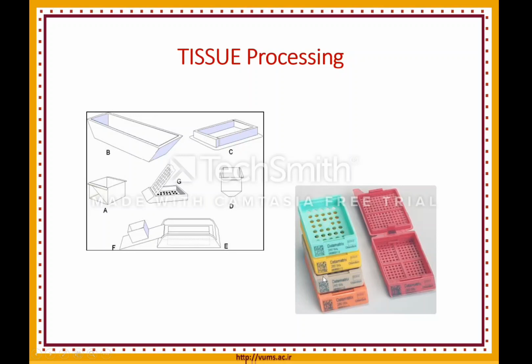These small baskets are the location for putting the tissue, which, as you see here, have different types that we can close the door of. We label the tissue in this step. For example, this is a liver, this is a kidney or other. Write by pen and put inside of this basket and close the door.